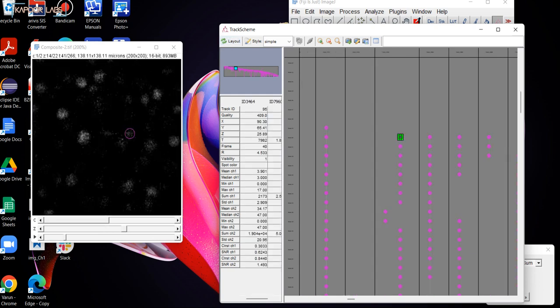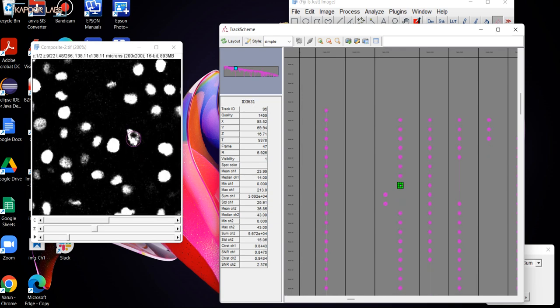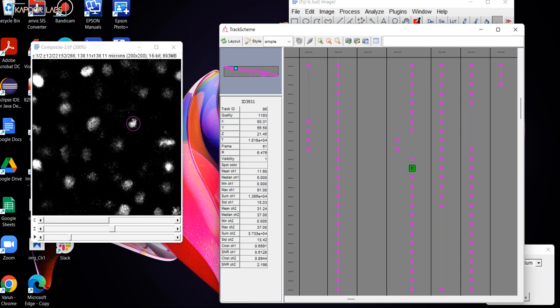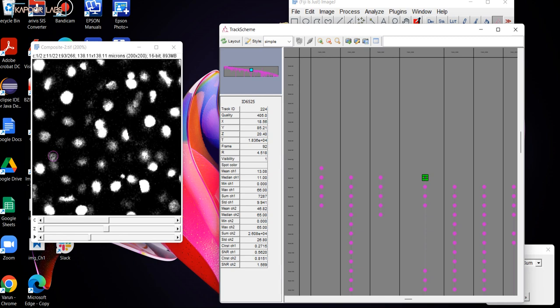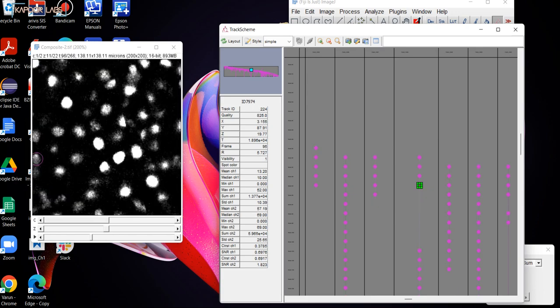So here's one. Okay, this kind of looks like apoptosis, right? But it's okay because in apoptosis the cell also kind of splits into multiple fragments, so it's fine. Then we have another one over here, and this is the cell on the bottom left, kind of like in the middle.